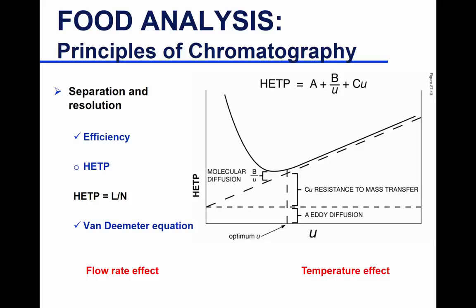The three factors that impact the height: first, eddy diffusion, which we talked about. This is controlled by the size of the particles of your packing material. If they're large, you will have multiple pathways, the solute stays longer in the column, and you have a broader peak. The smaller the particle size of the packing material, the smaller your eddy diffusion, the better your resolution.